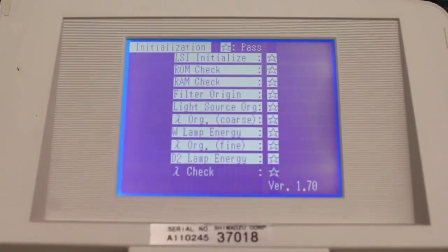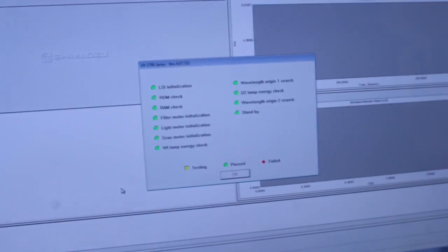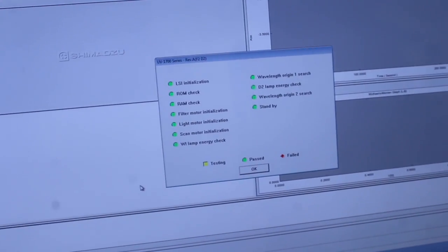When initialization is completed, you will get a confirmation on the screen. Click OK.